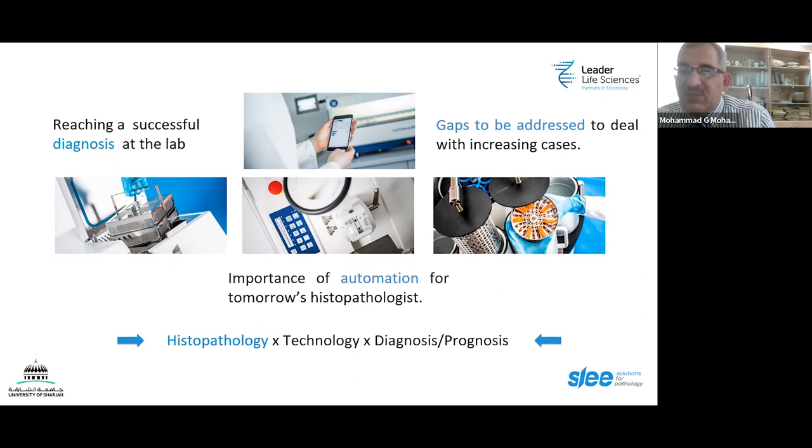Now they are mastering both things, the same for the microtome. They do it with the manual microtome and then they try the automated microtome and so on. This way they are mastering both things, covering all of the labs that they are going to go into. And all the time you are not guaranteed what setup you will have.